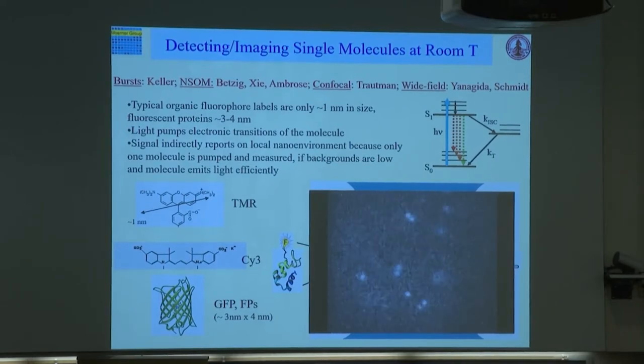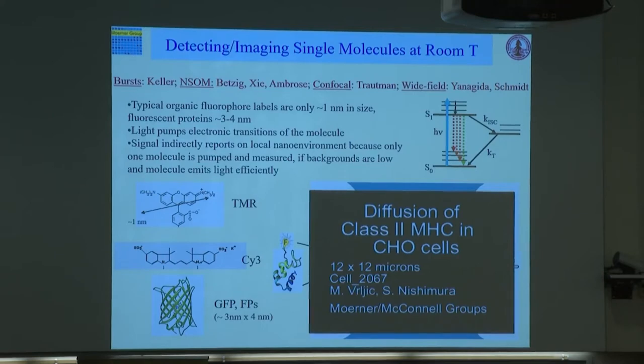And you see them disappearing. Some molecules are going away. That's photobleaching. Molecules give us maybe a million photons before they give up. Some special cases, of course, can do better. But you see that we have to live with those finite number of photons. Everything that we do becomes an estimation challenge. How do you learn as much as possible with a finite number of photons?